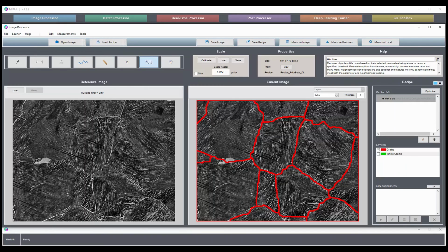Now we could look at ASTM grain size to finish this one off. We have the scale factor calibrated. If you have an image with a micron bar on it, it doesn't have to be the same image, it just needs to be one at this mag and resolution. We open over 150 different formats.